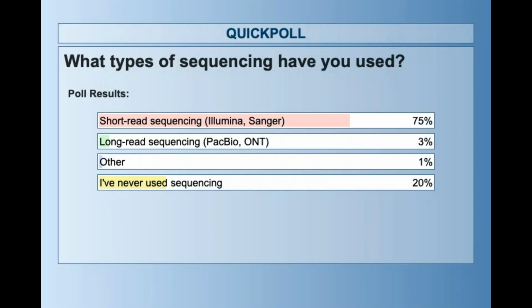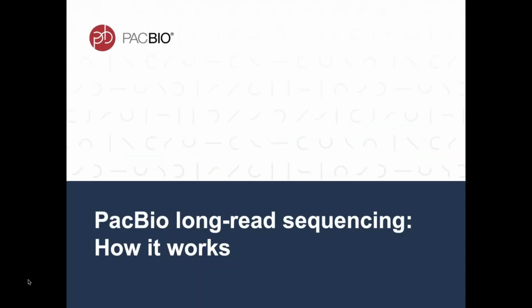Okay, it looks like the majority of you are very familiar with short read sequencing. So this is going to be a really great webinar to start dipping your toes into long read sequencing and specifically PacBio sequencing and what it can do for your research. So let's dive into that in more detail.